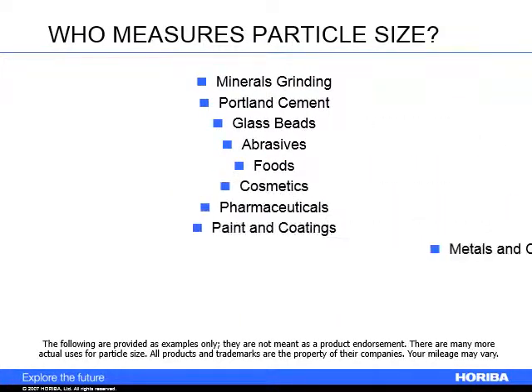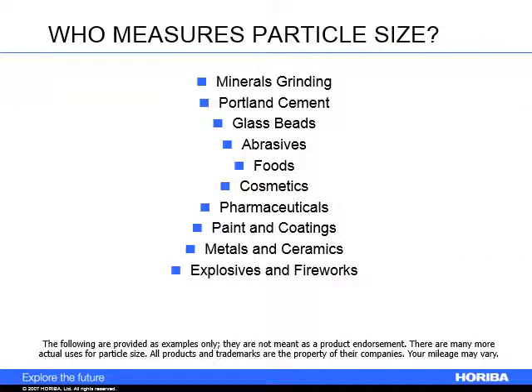So the measurement of particle size is common in many industries, as you can see on the screen, the details of which and why it's important sort of apply to each field. And I will go through some examples that I've personally worked on and give you some context as to why particle size can matter so much for so many things.